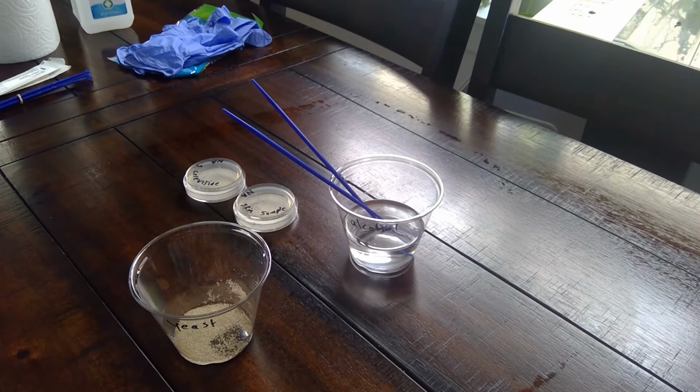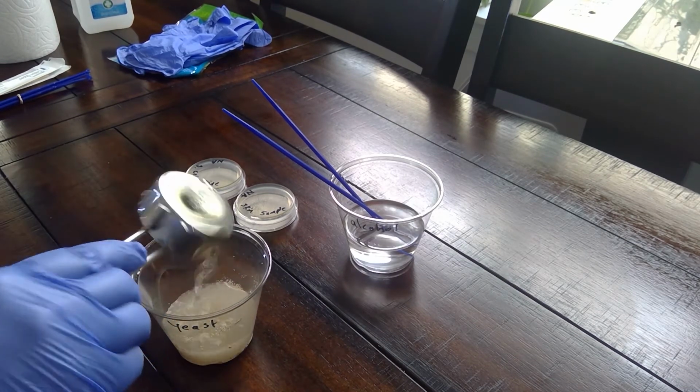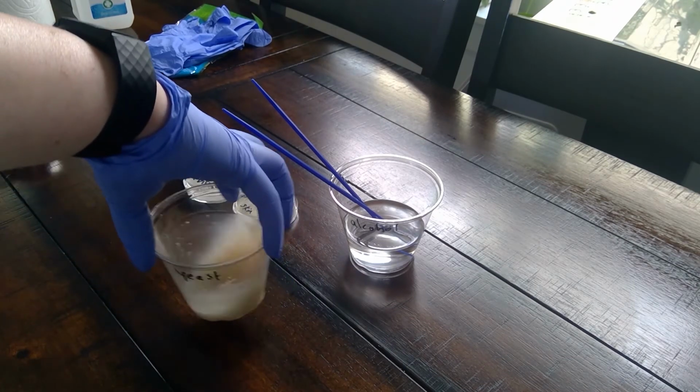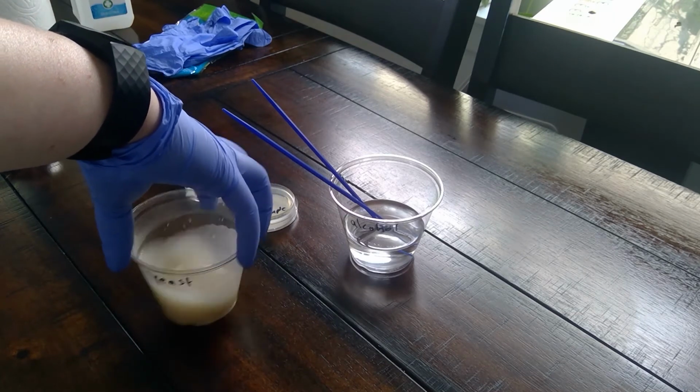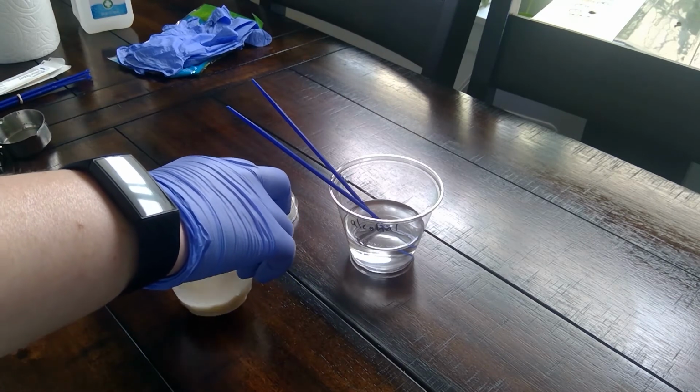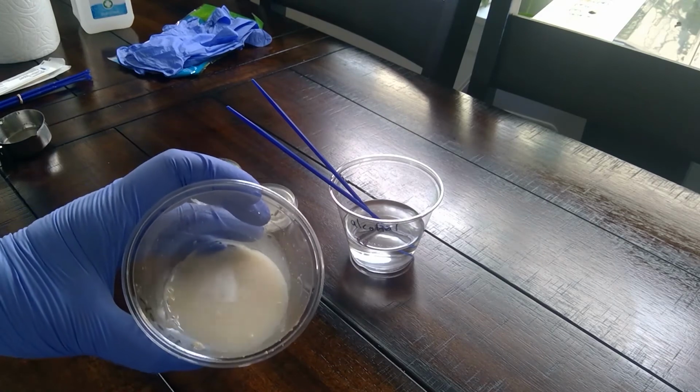And so now we're at step 9. Add approximately 1/4 of a cup of warm tap water to the yeast in the cup and swirl until dissolved. So I am going to run my water until it's hot, and then I'll grab a 1/4 cup of water. All right, so here's my 1/4 cup of water, and it says swirl until dissolved. Mostly, if it's stuck to the sides, you just want it to get in the water. But this is kind of what it looks like.